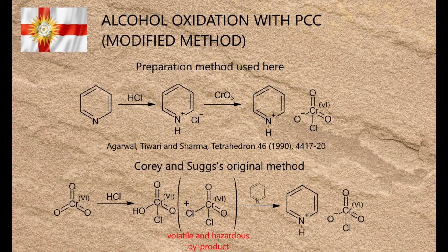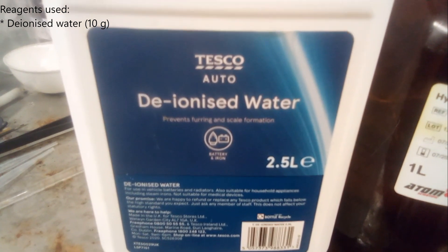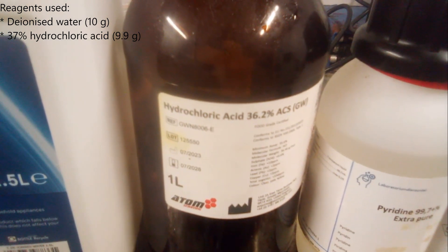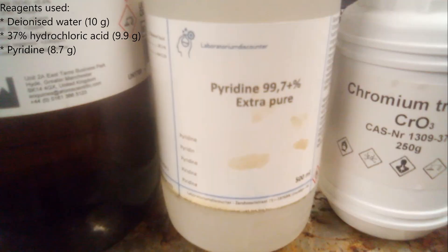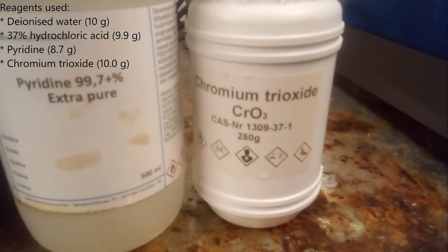Not only is it safer than Corey's original method, which forms highly toxic and corrosive chromyl chloride as a by-product, but it also gives consistently higher yields. The reagents used were: deionised water, 10 grams; 37% hydrochloric acid, 9.9 grams; pyridine, 8.7 grams; and chromium trioxide, 10 grams.